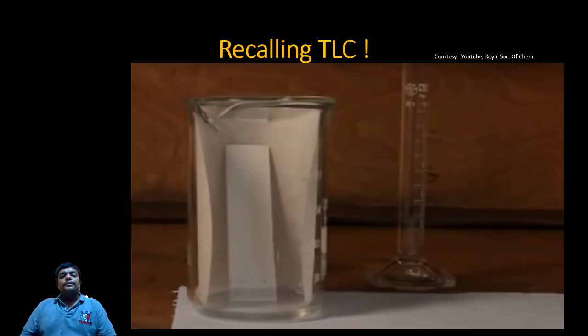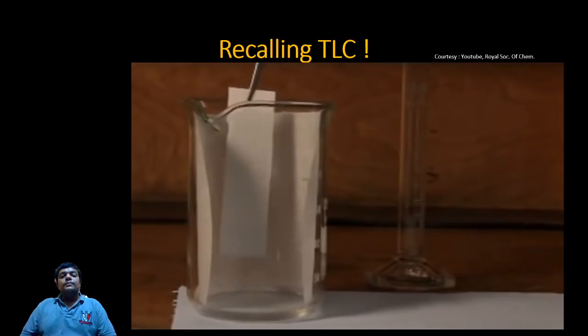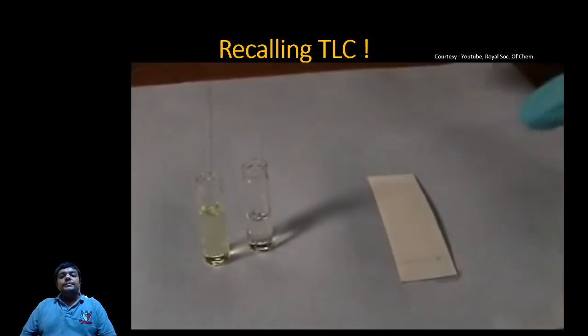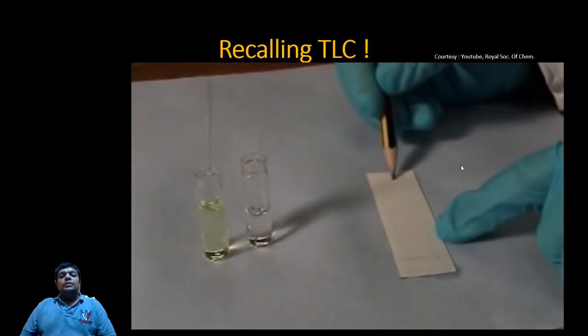You'll see there's a piece of filter paper in the chromatography tank, which is a beaker. This helps to saturate the atmosphere with solvent vapours. Once the solvent front has got to the top of the plate, remove the lid, take the plate out and draw a line where the solvent front is so you can work out your RF values. See, first of all, they are marking the level up to what the mobile phase has run.